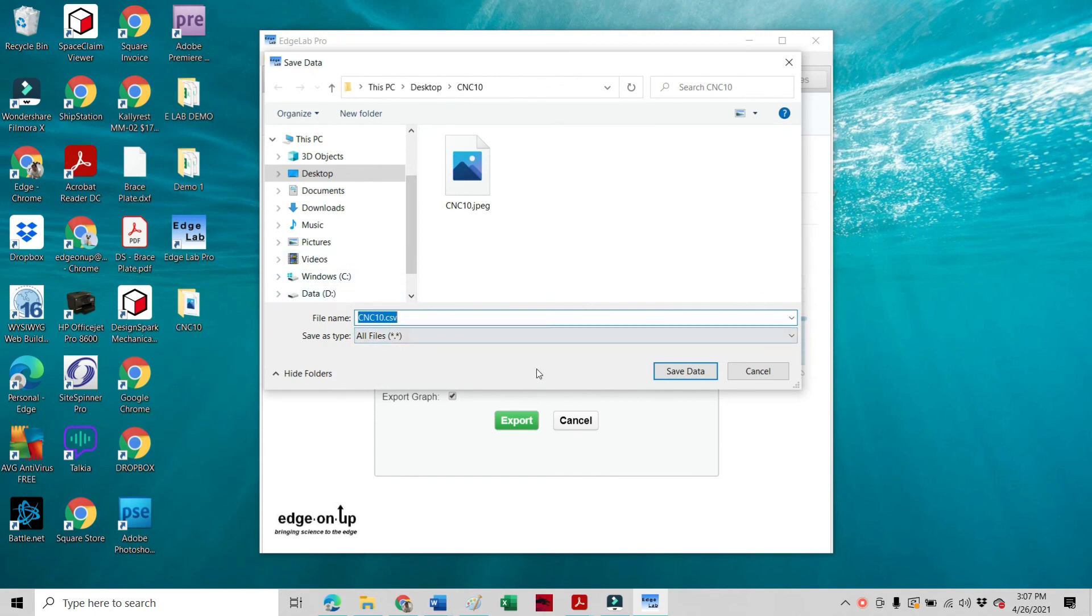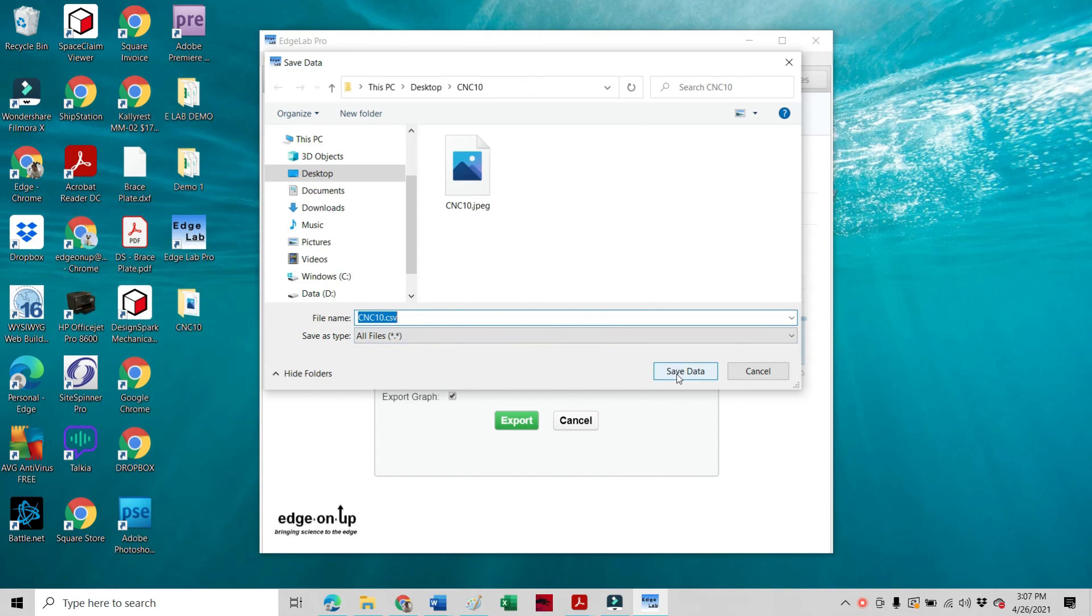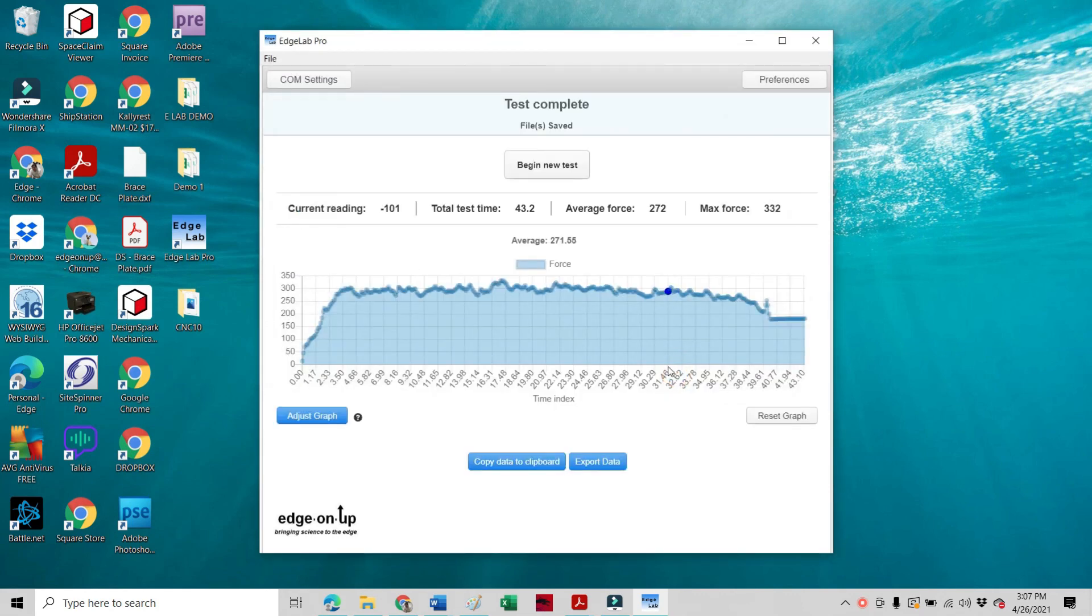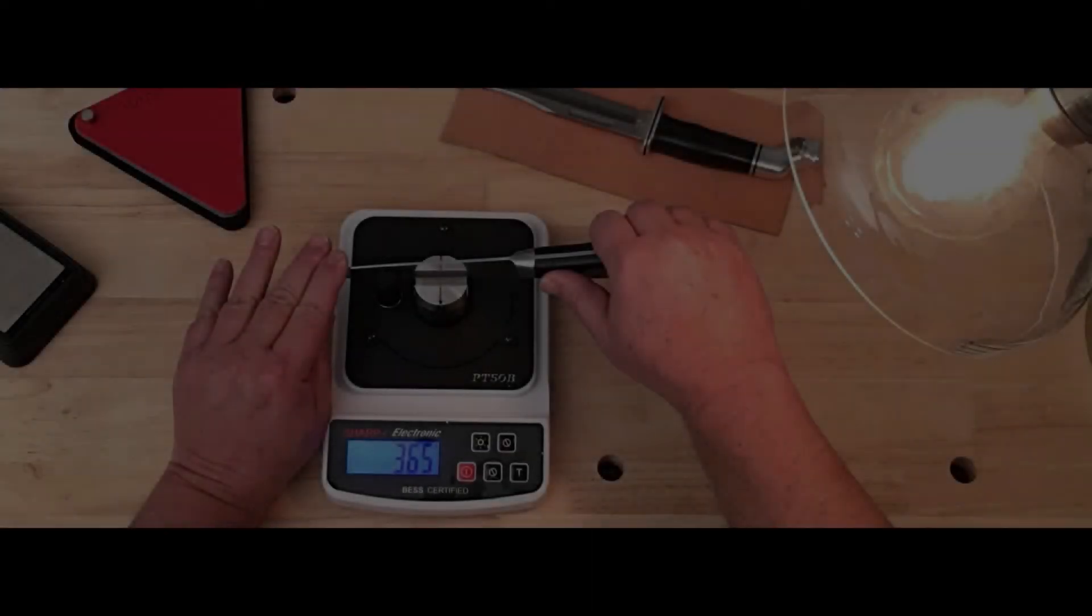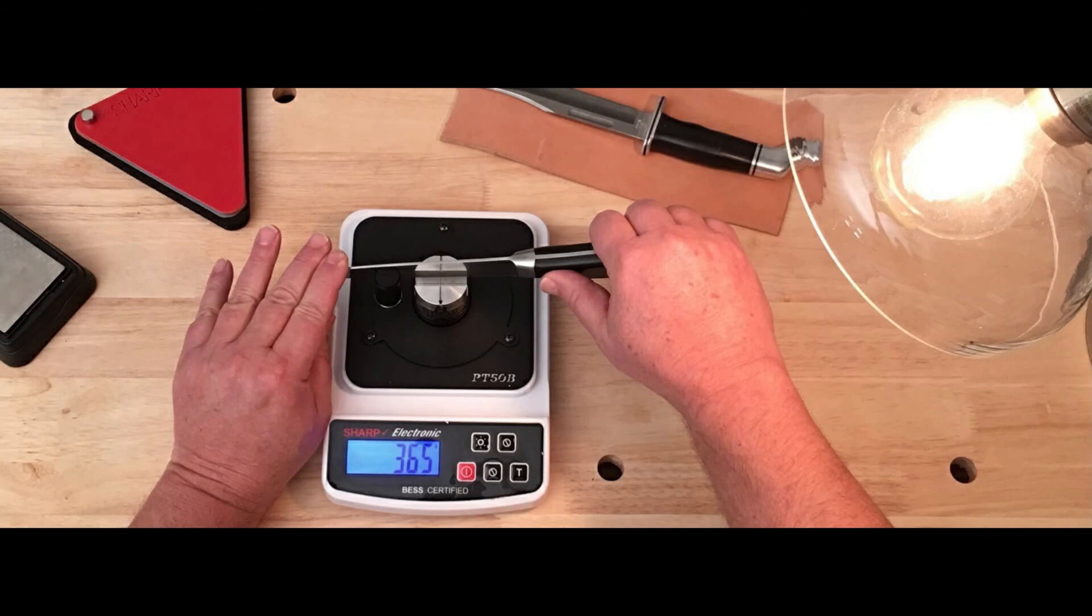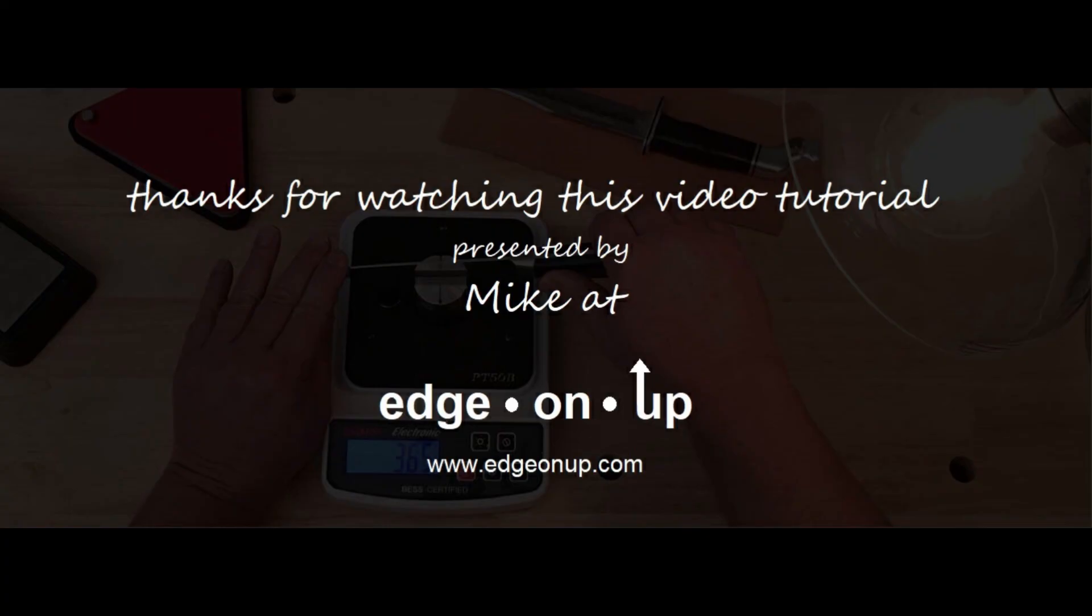Okay, so let's say Adjust Graph. And I think we can probably safely take everything off here. And that alone raised us to 280. And then if we go Adjust Graph and let's go about here, now we're at 290. So that's what trimming can do for you. And you'll notice that's right smack in between where our two manual tests conducted with the same kitchen knife was in our manual tests that we did in our earlier tutorials. And if you haven't seen that, go back and check it out and you'll see. And then look what that does to our resolution of our graph here. Now we can really see the ups and downs. Now that's not a lot of grams because it's just blowing up so much, but it surely is interesting, isn't it. Now we'll do some tests here where we intentionally dull a spot on a knife and we'll go through the test a little faster and we'll make that stick out, but that's to come. So let's do this, let's reset our graph. And then let's go up here just so that you know how this is done for sure. Whoops, I'm in the wrong place, so I'll say Cancel. So we want to Export This Data. We could copy it to our clipboard, but we don't want to do that. I've made a folder on my desktop called CNC10 over here, and I think that's where we'll put it. Export Data, we'll just call this CNC10. This was, we'll just say that was 30 for SLC 30 test media. We won't leave any notes. We're going to export both the graph and the data. We're going to say Export. We're saving it in the right place here. This is the, it saves as you can see, Save Graph Images as a JPEG, Save the Graph Image. Okay, and now save the data in the same place, and of course that will be a CSV file that you can stick into Excel if you want. Okay, that's it. Thanks for tuning in, and when the music comes on, that means it's time to turn the lights in our carping room.